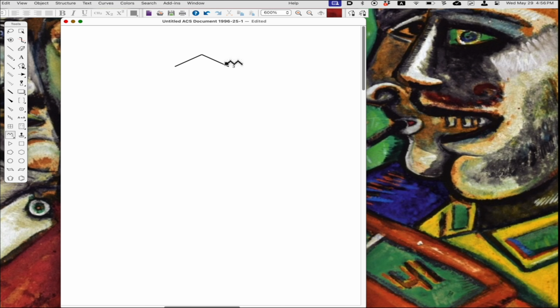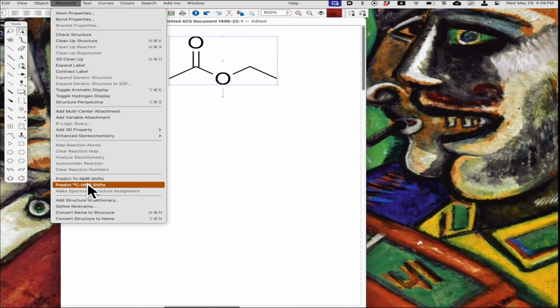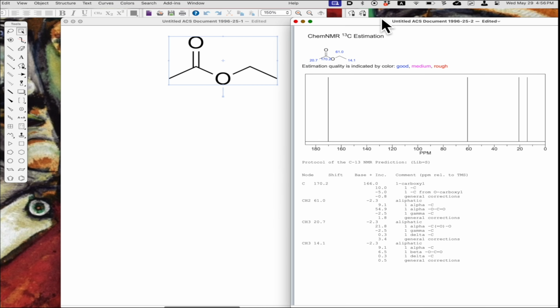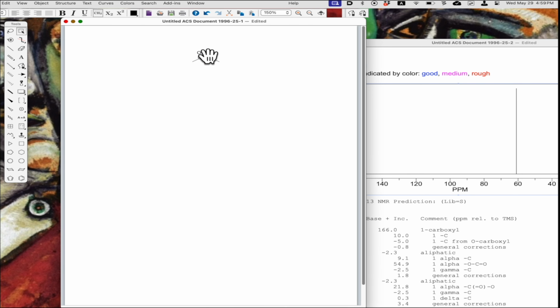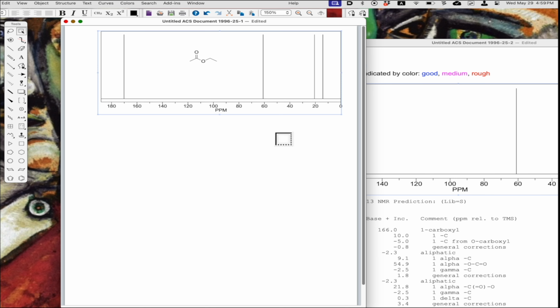All 4 carbons in this molecule are inequivalent, so we would expect 4 C13 NMR resonances. When assigning, pick peaks at extreme values first. For ethyl acetate, there should be a carbonyl around about 200, and there is. It's a little below 200 because it's of the O double bond CX type. There should be a methyl group of the ethyl at very high field, and there is. The methyl group attached to the carbonyl is a little bit downfield of this, and the CH2 attached to the oxygen is more downfield. The assignment by ChemDraw and me agree.